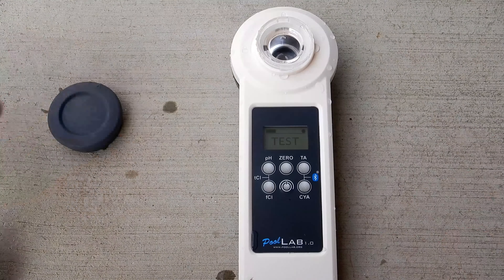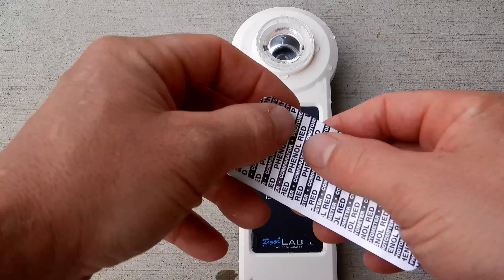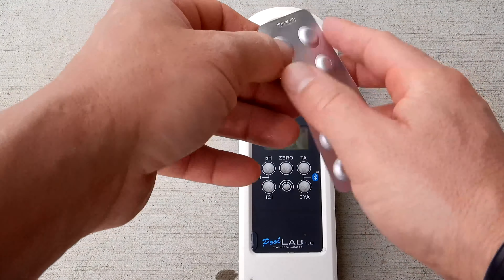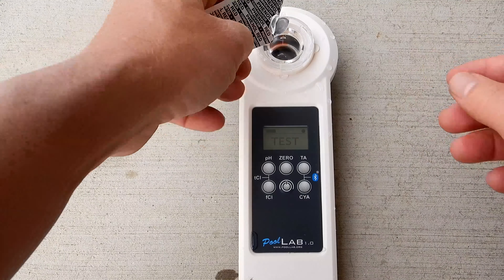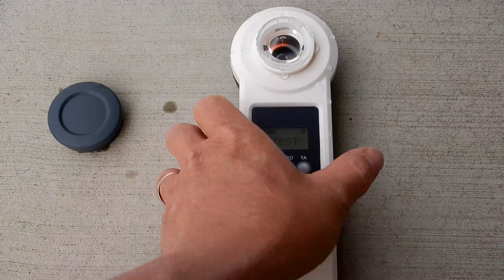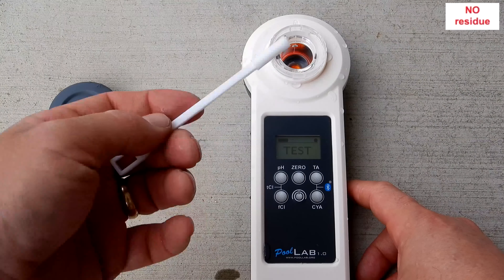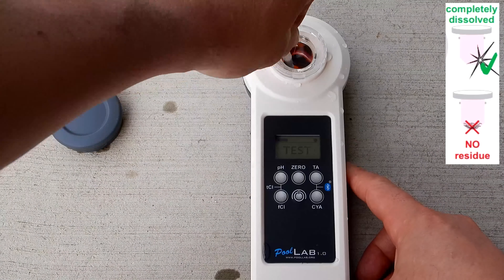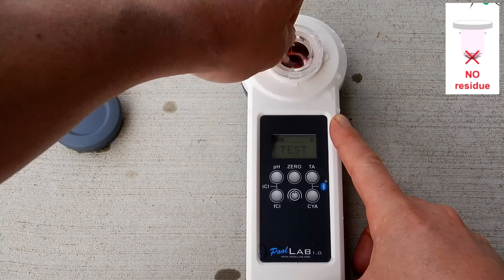Go ahead and remove the cap. I'm going to start with the pH test. You don't want to touch the tablet, so I'm going to push it through here. You can see the tablet in there — we're going to break that up and stir it using the stir and crusher. You want to make sure the tablet is completely dissolved before you run the test.